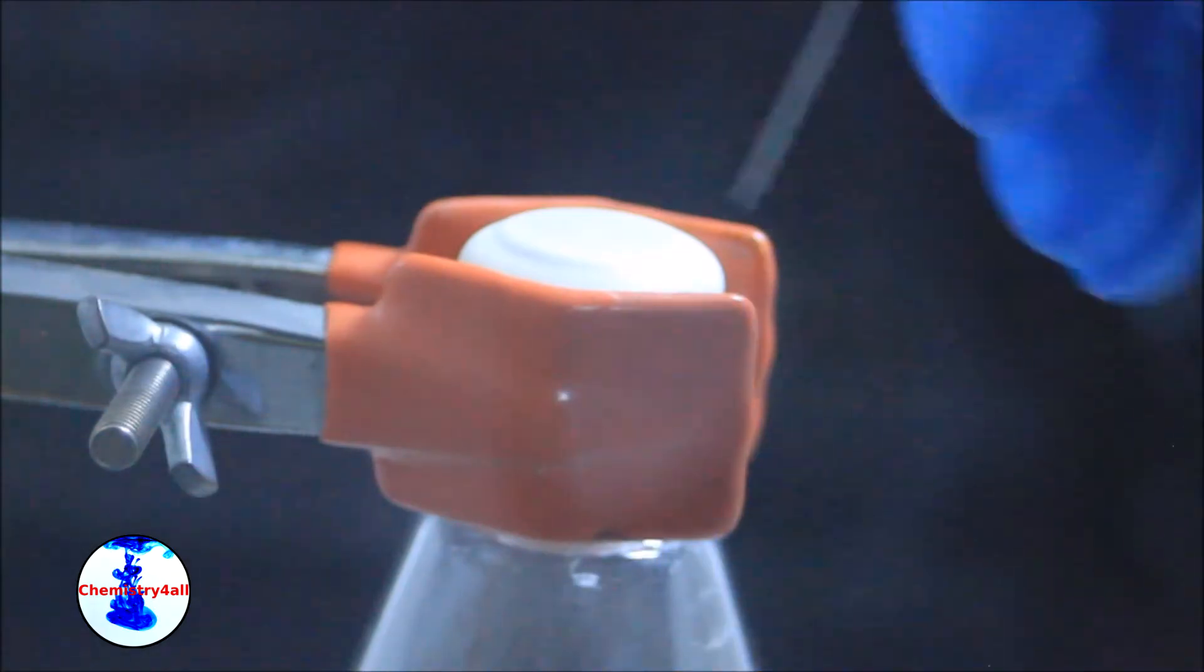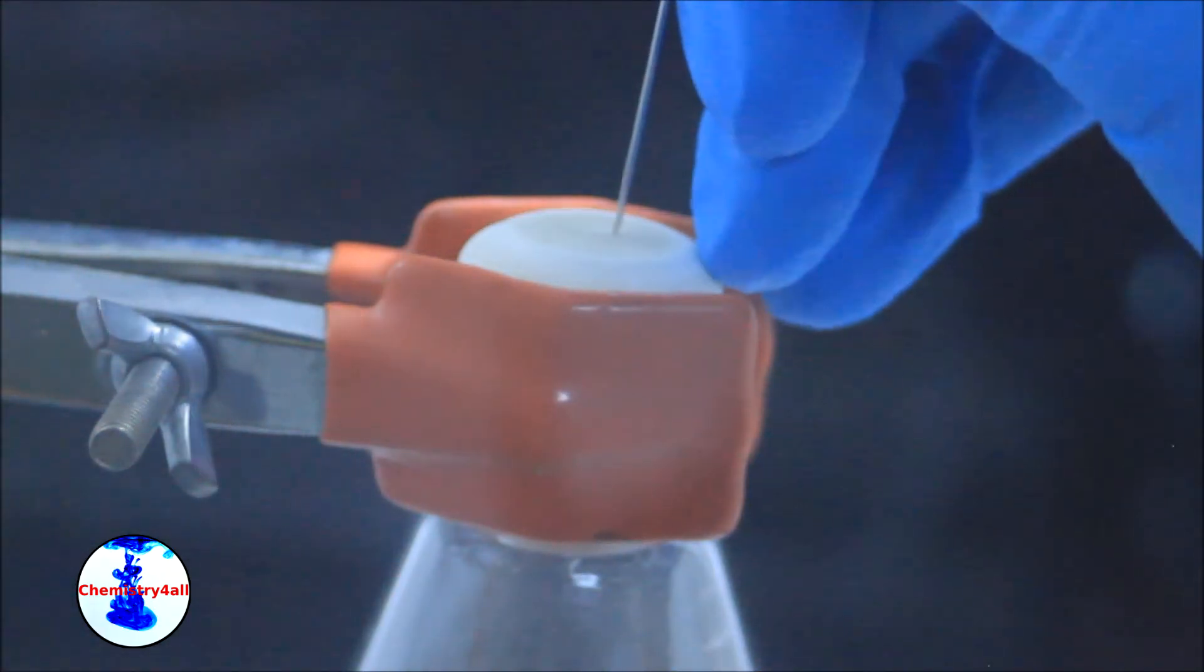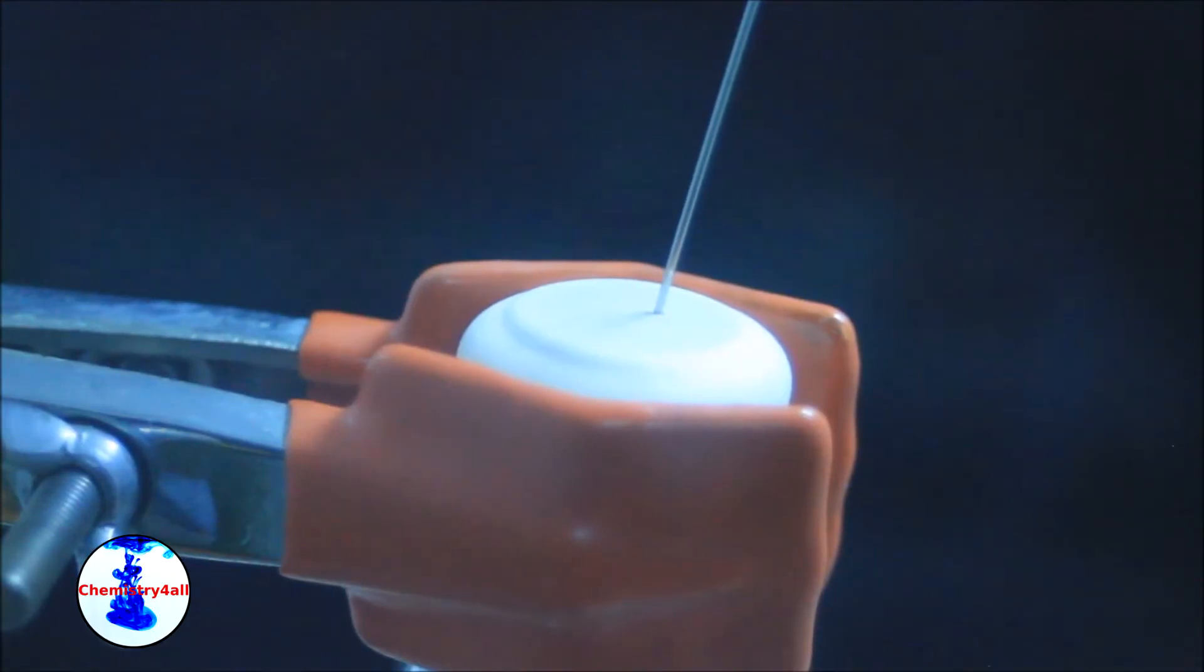Then the balloon is connected to the septum of the flask and another needle is added so that we can flush the flask with argon.